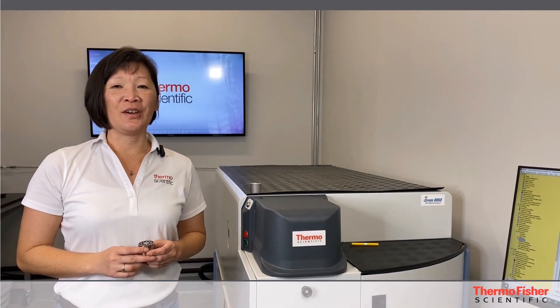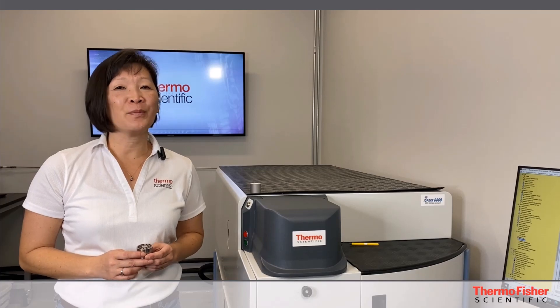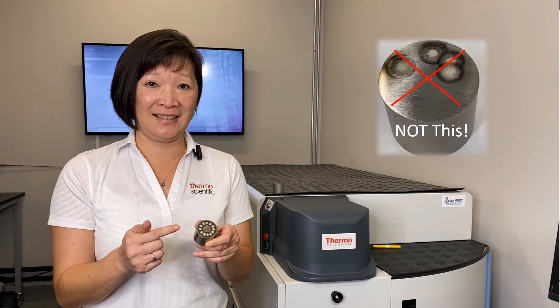Welcome back guys to the GNT show. We want to invite you to take the burn challenge with us today. We're going to show you a technique we learned from the experts in Switzerland on how to consistently burn the sample in the correct position. One of the many things we learned from our colleagues in Switzerland was how to do a correct burn.